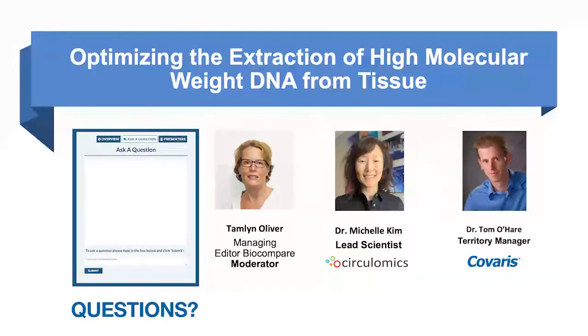Okay, should the tissue samples be pre-cut before processing in the cryoPREP like usual tissue lysers? It depends on how you got your sample. Sometimes we get samples and they are not frozen yet, and so I will aliquot them into single extraction amounts and give them a good chop with a razor blade or surgical scalpel before freezing them. For some people, they don't want to thaw their sample because they don't want to give it a freeze thaw, so they might just have a solid chunk that can't be chopped first. I think both are fine to go into the cryoPREP.